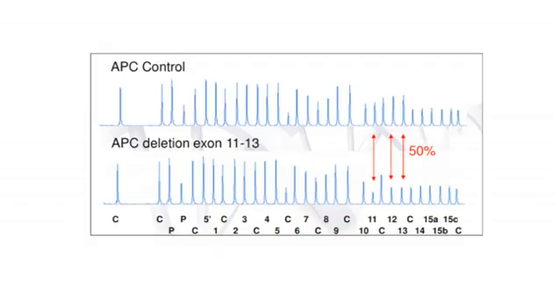Here's an example of what an MLPA trace looks like once the amplification probes have been separated. MLPA has been undertaken here for the APC gene. Each blue peak represents a different probe targeted to a specific region of the APC gene, and the relative heights of these blue peaks indicate the amount of amplification product available for that specific probe. Comparing the control sample to the patient sample, probes 11, 12 and 13 show a half reduction in height, indicating half the amount of amplification product and therefore a heterozygous deletion of exons 11 to 13 in this patient sample.